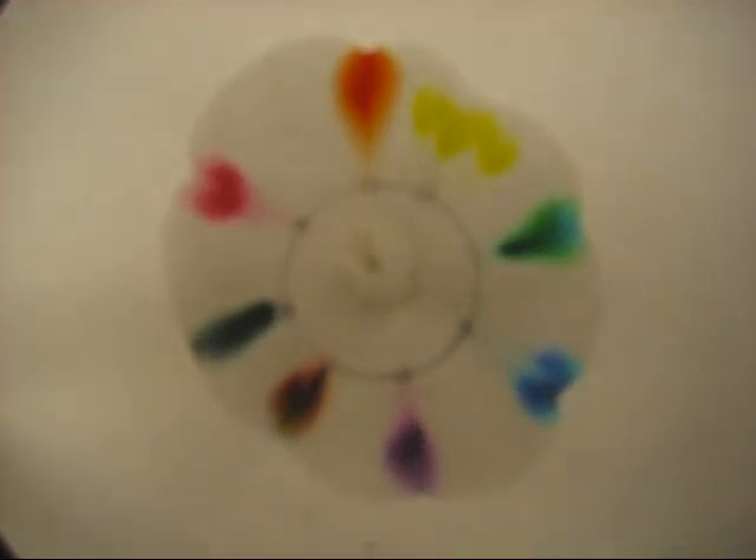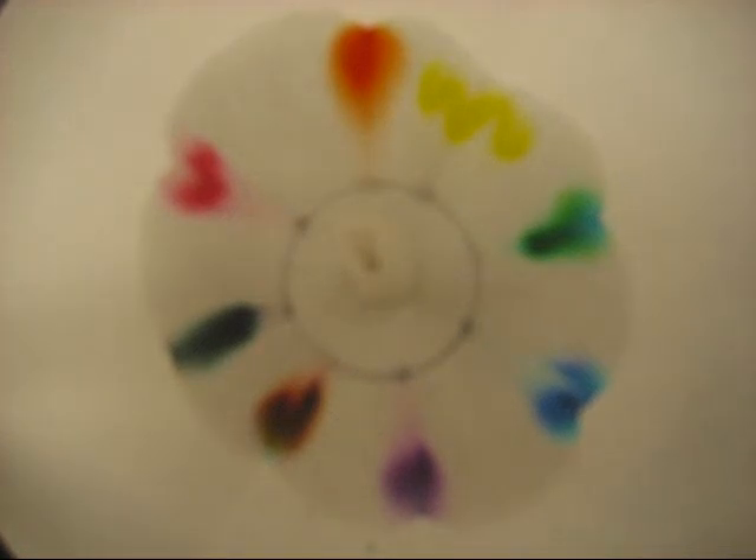With the black you can see a little bit of lighter tones — maybe a yellow there around it and some blues there also. The most interesting of the mixtures is the brown, which has shades of green, yellow, and red, if not others in there as well. Most of the other colors appear to be pure colors.